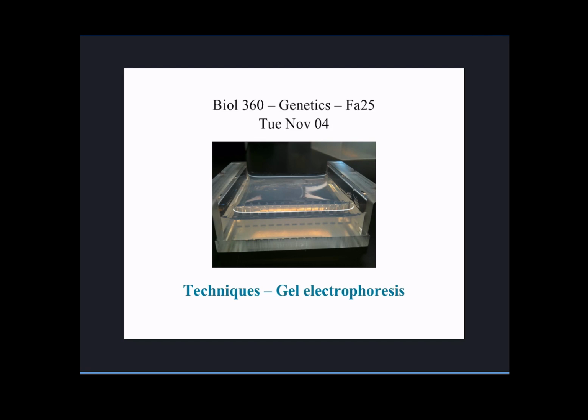Today we'll discuss another important technique that we use regularly in molecular genetics labs and molecular biology labs called gel electrophoresis. Some of you may have heard of this technique before. Well, some of you may have even used it before, but we'll go through some of the theoretical framework for it, and we'll introduce it today because we are going to refer back to it quite a bit through the end of the semester.